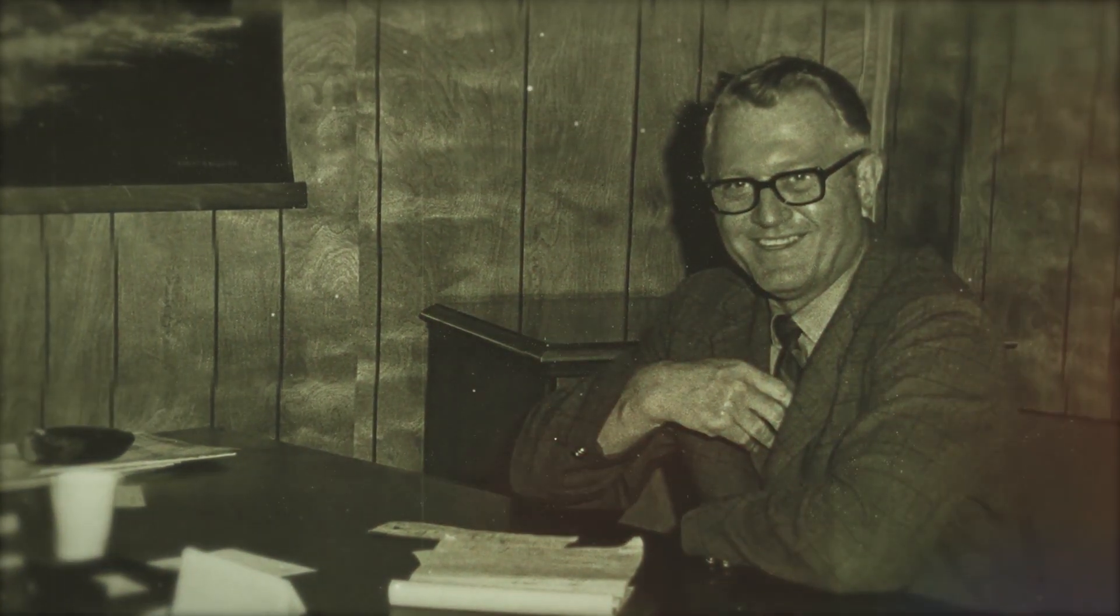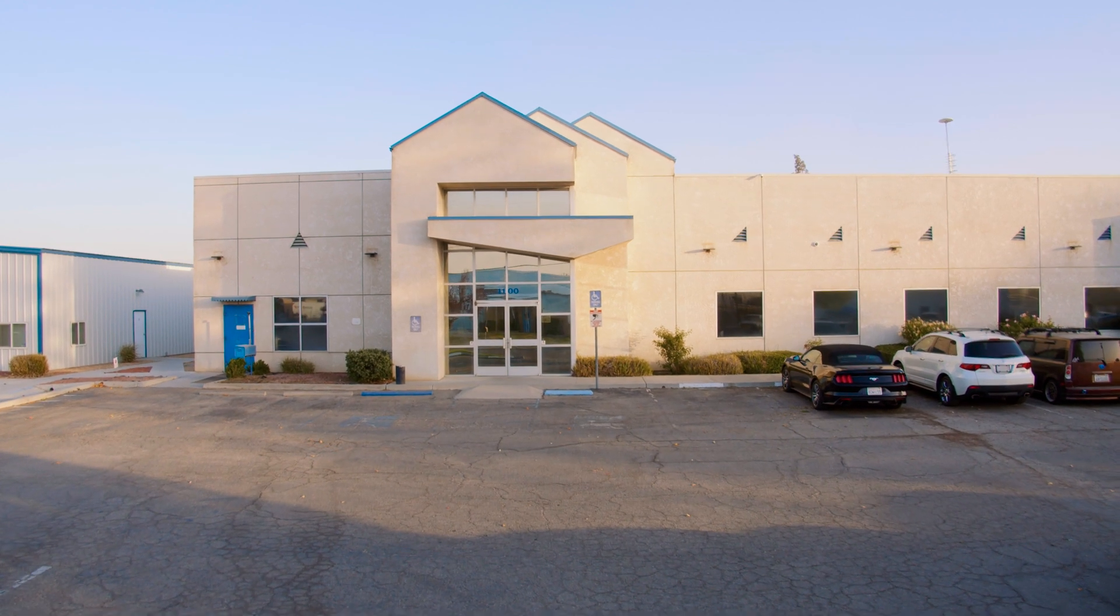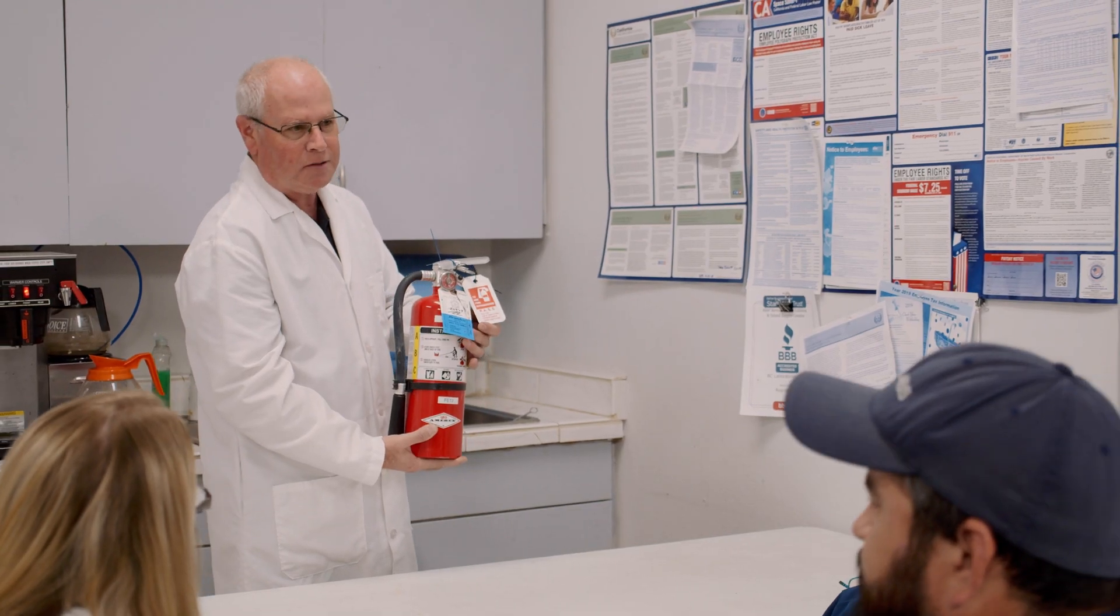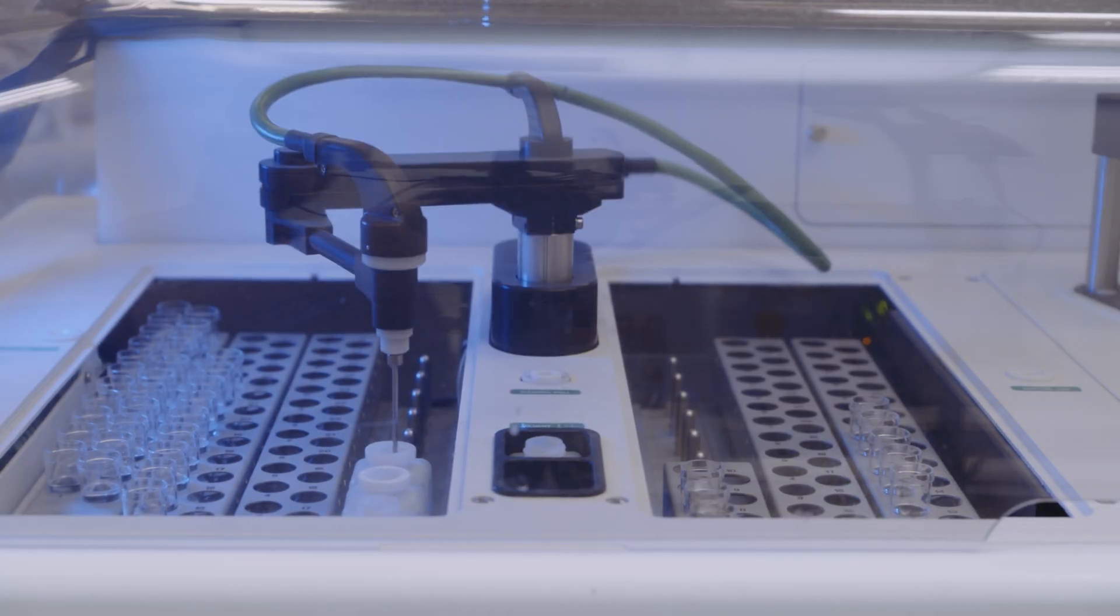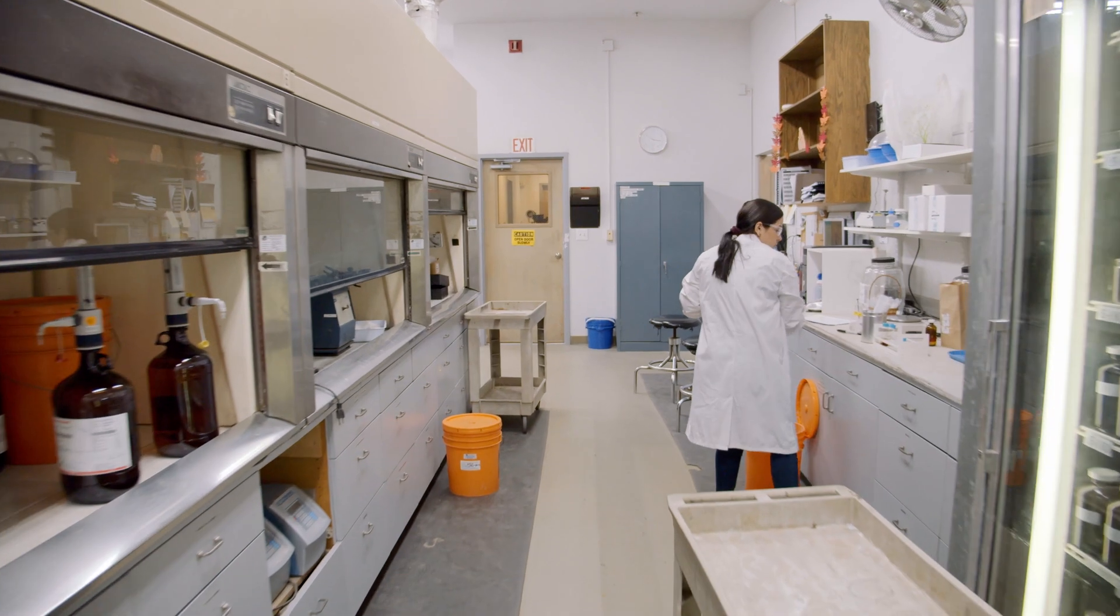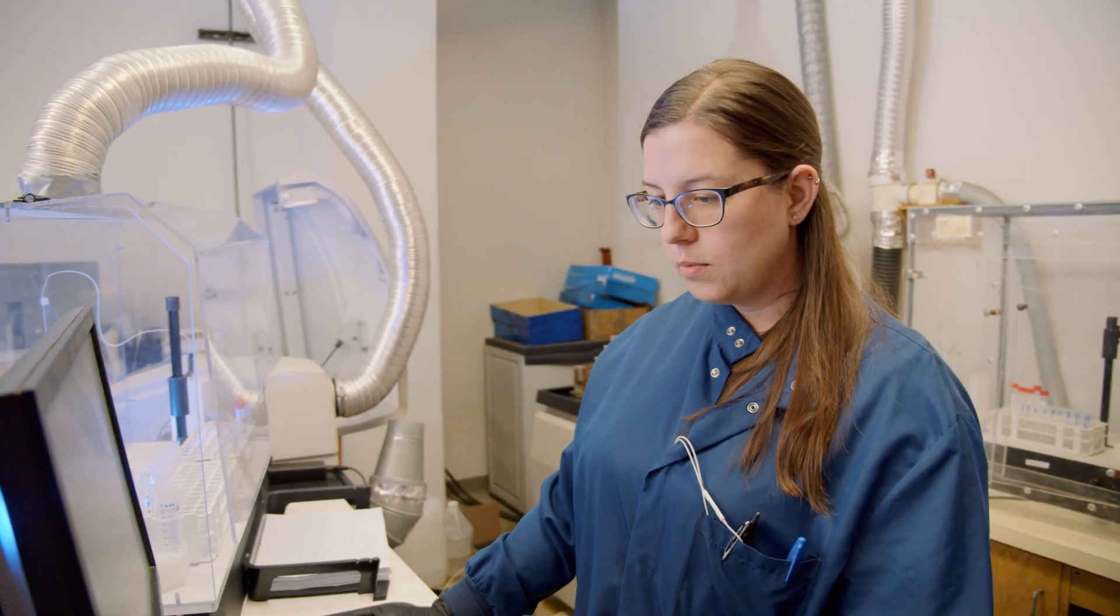Established in 1949 from humble beginnings by visionary Joe Eglin, BC Laboratories has expanded from a one-car garage into a 30,000 square foot state-of-the-art facility with over 100 employees. Joe's legacy continues on through his son Rich and his daughter Carolyn. My brother and I are very proud of what our father built from humble beginnings to a company with over 120 employees.